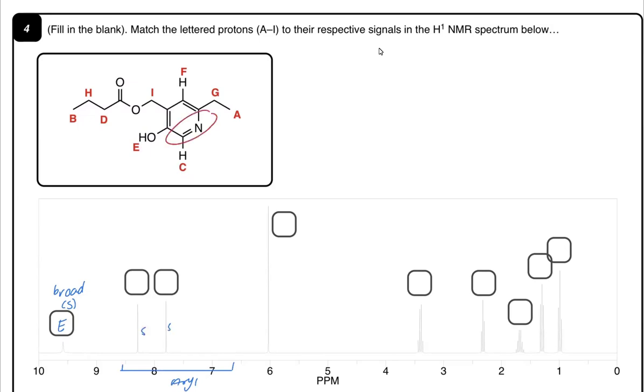Now, you'll also notice that the nitrogen is within the ring. If the nitrogen is within the ring, it has an inductive effect, so it's pulling electrons towards it. I would say that's enough right there to say that C is more downfield than F. Nitrogen is pulling more predominantly from C. Now, for argument's sake, let's say that nitrogen wasn't there. If it wasn't there, then I would have to acknowledge the OH is on the ring, and that would resonance donate.